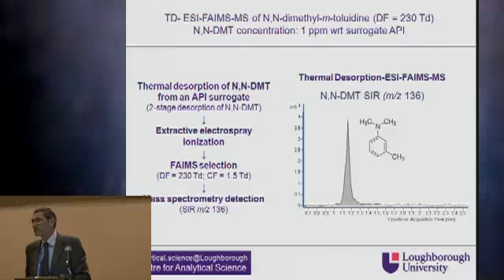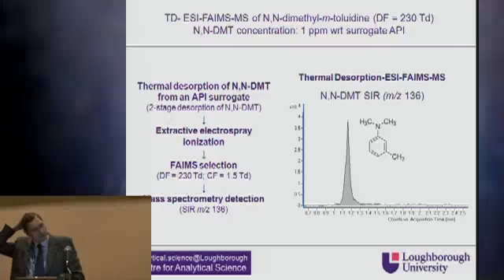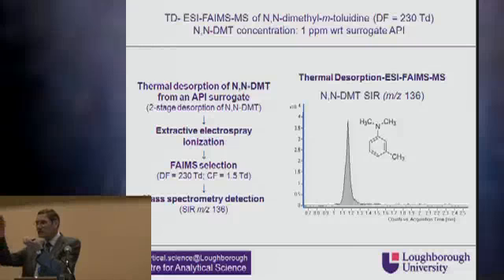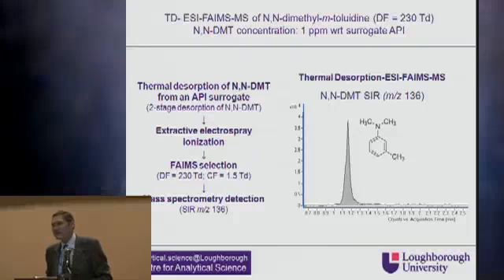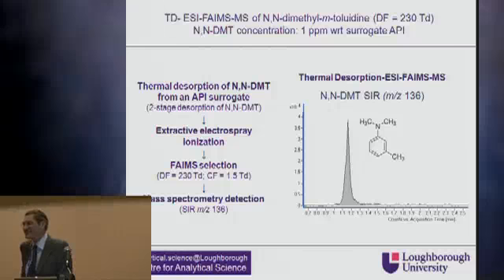It sounds more like chemical ionization, generating ions from an electrospray source. Well, that's a matter of uncertainty. What we don't know is whether you are dissolving your molecule inside the droplet and then getting normal electrospray, or whether it's some more complicated surface-related process. It's difficult to distinguish between the two. But it works. That's the main thing.